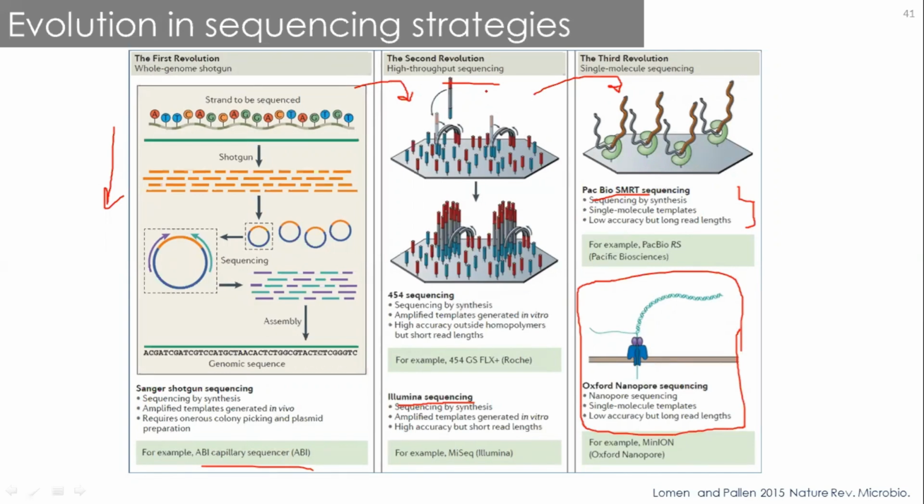What I mean by bigger fragment: when you use second generation sequencing, you will get 100 to 200 base sequences in one stage. Then using bioinformatics, you have to make a proper big gene piece by aligning these 100 to 150 base reads, in a very cumbersome method. Whereas in this particular method, you will get more than 1 kb, or sometimes even 10 kb or 20 kb length.